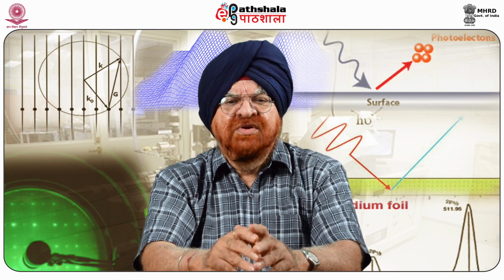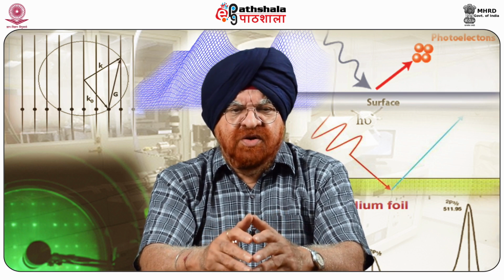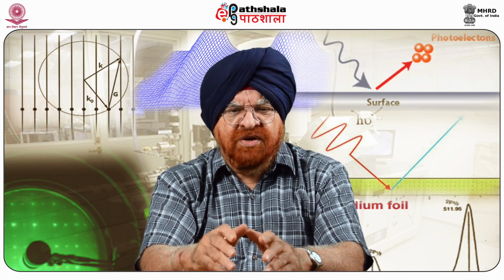We come to the ambient measurements in liquids. Capillary force is a major problem in tensile force measurements since it effectively strengthens the tip surface interactions. It is usually caused by adsorbed moisture on substrates from ambient environment. To eliminate the additional force, measurements in liquid can be conducted.